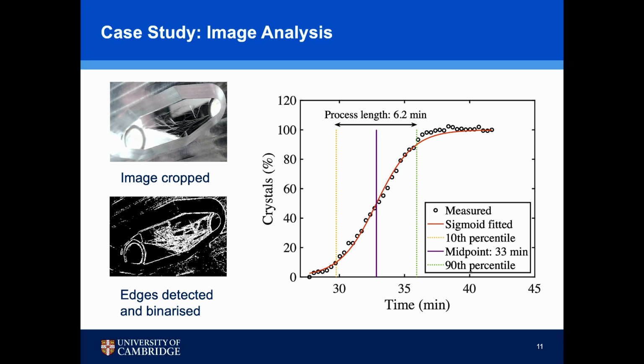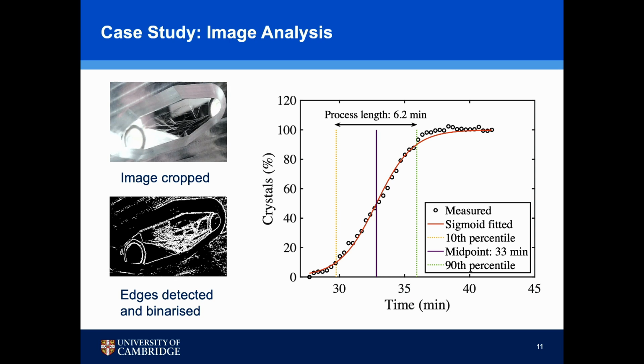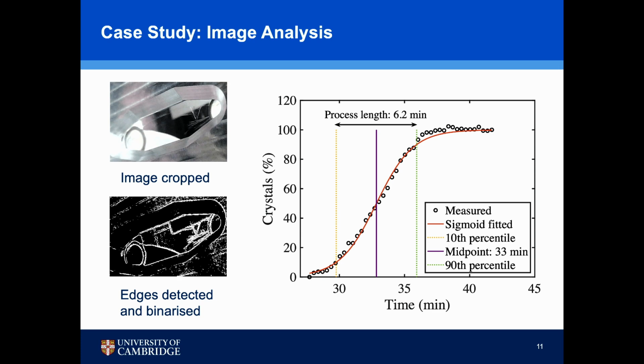In the figure on the right side, if we define the start of the growth at about 10% and the end of the growth at around 90%, the whole process takes about 6.2 minutes for this set of data.